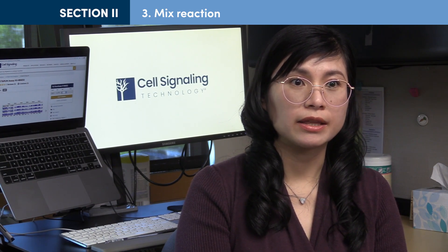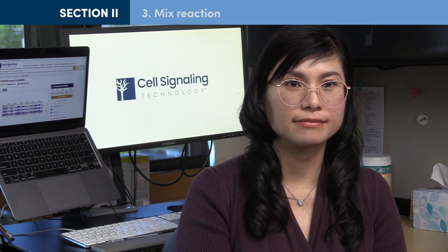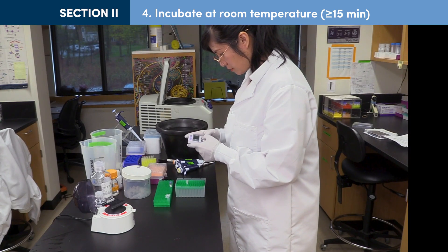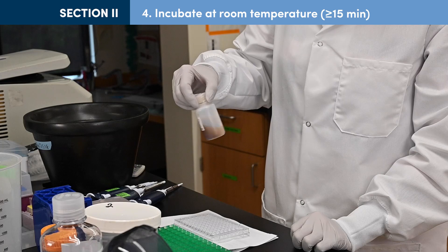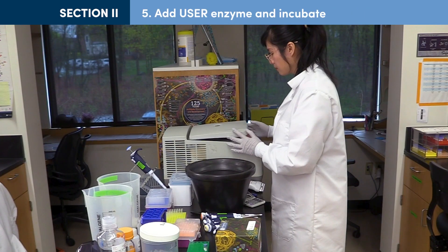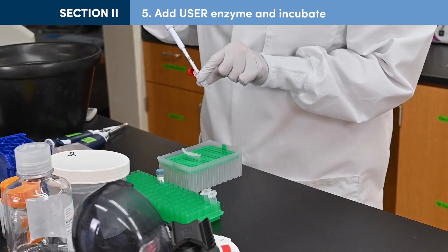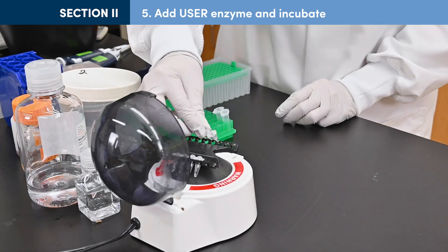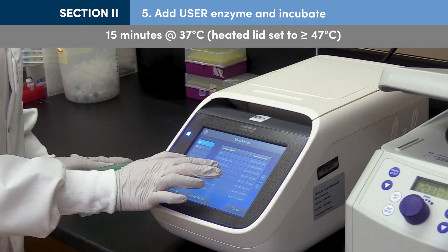The ligation master mix and the ligation enhancer can be premixed ahead of time, as noted in the protocol, but adding adapter to the premix is not recommended. After a quick spin, incubate the ligation reaction for at least 15 minutes at room temperature. If you will be proceeding directly from adapter ligation to DNA cleanup without stopping, at this time you may begin warming up beads and preparing fresh 80% ethanol and tris chloride. At the end of the 15-minute incubation, collect user enzyme at the bottom of its tube with a quick spin. Add 3 µL of user enzyme to the ligation reaction. Mix well by quickly inverting the tubes or pipetting, followed by a quick spin, and incubate for 15 minutes at 37°C with the heated lid set to at least 47°C.